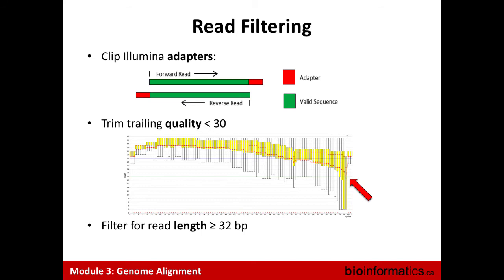So I know that some groups prefer to be more stringent because they want really high quality, and they will cut at 50 or 75 for a read length of 100 because they only want really long reads and quality. But that means you will lose some coverage. And coverage is also important when you do variant calling. So each time you decide, it's a kind of balance. I want to minimize my cost. I want to maximize my benefits. And 32 is the commonly accepted value.